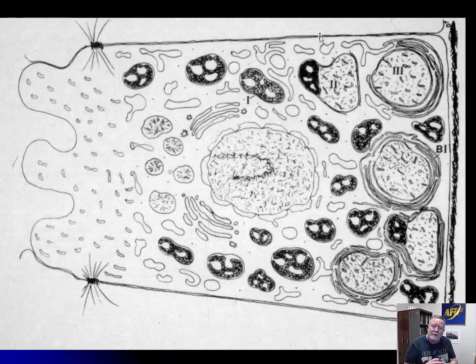So anything that damages the organelle membrane or the high amplitude swelling will cause the formation of these lamellae, which some people call zebra bodies. Zebra body is a term that's used a lot in ultrastructure and is never really used appropriately, but I've heard them called zebra bodies. So they're just lamellae of effete and broken down membrane.